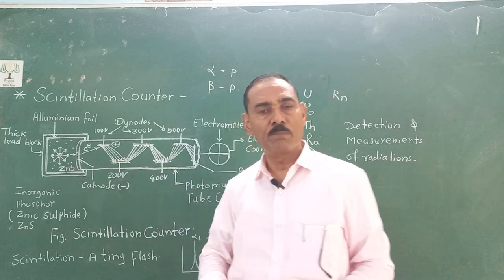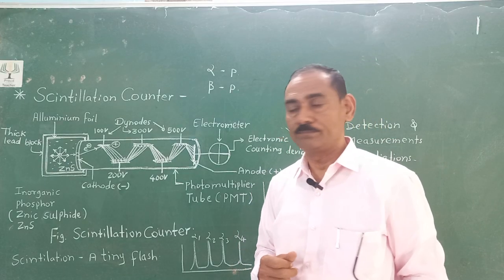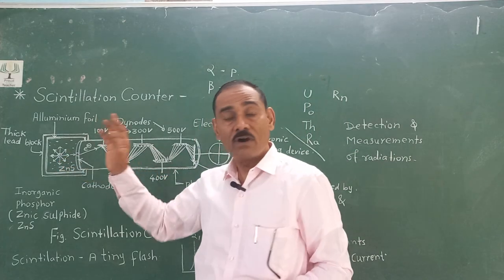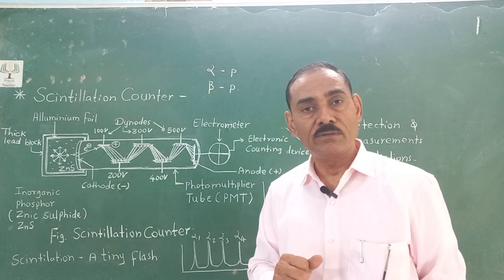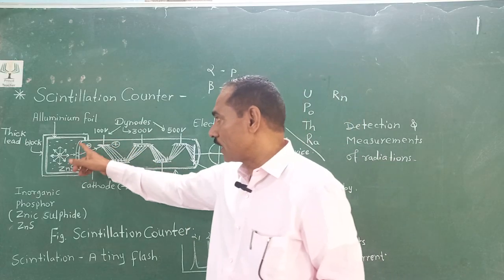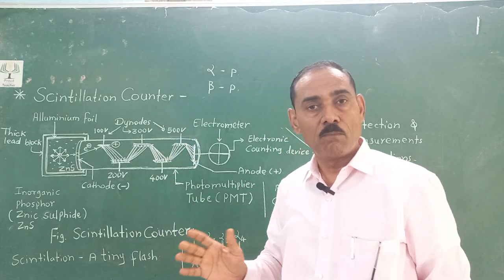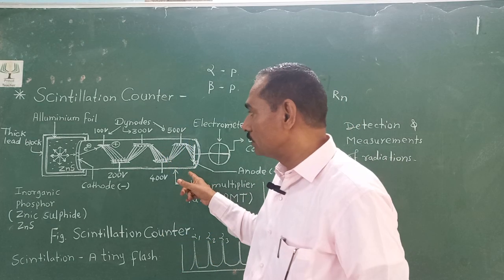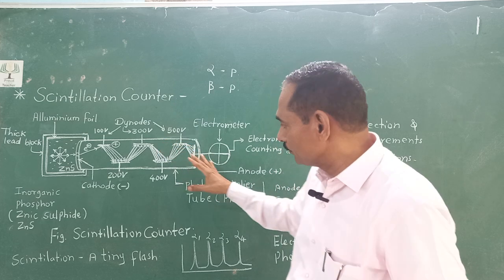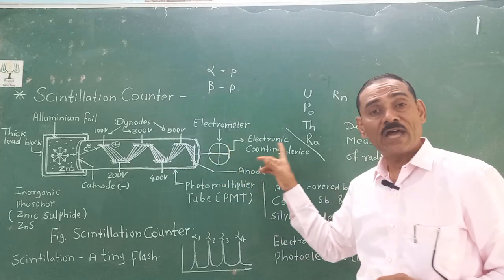Because these radioactive sample sources are hazardous, they are corrosive, cancerous, or affect the skin, burn the skin, or affect the eyes also. That's why this whole device is packed in a box, inside which this PMT is kept, and this device is completely automatic.